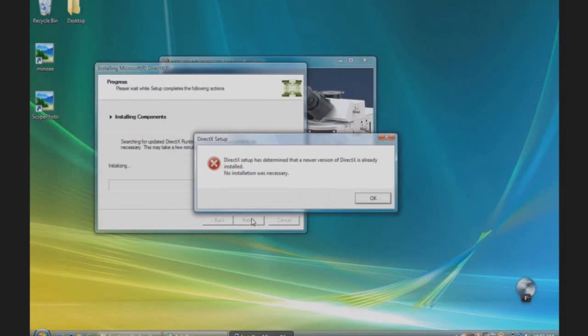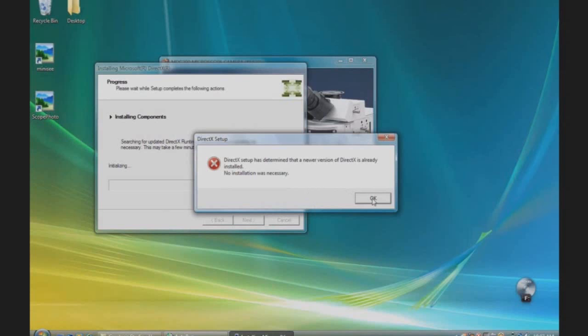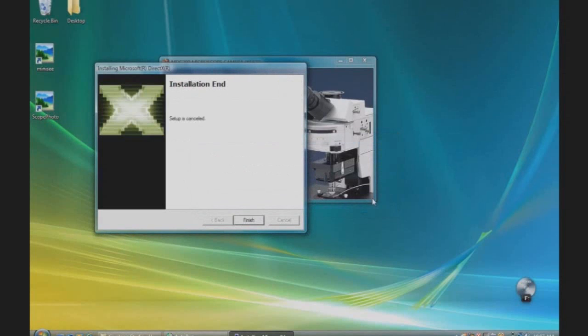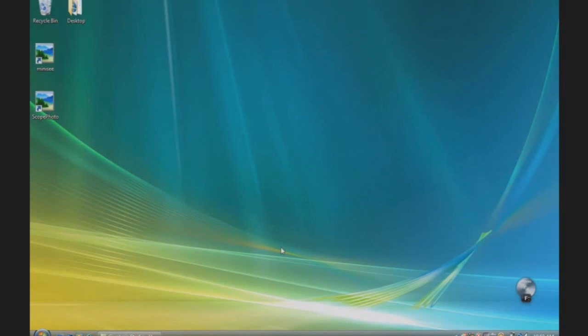In this case, the newest version is already installed, so we will continue. To finish the installation, we will test the camera. Double click the Scope Photo icon.